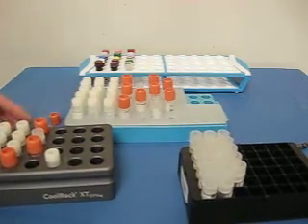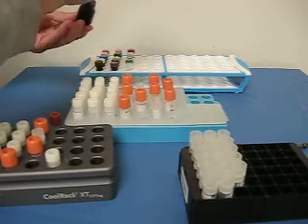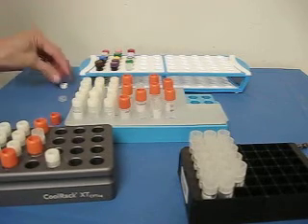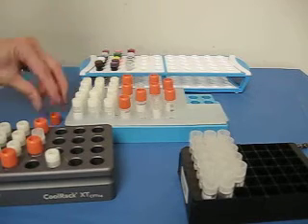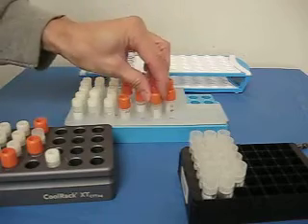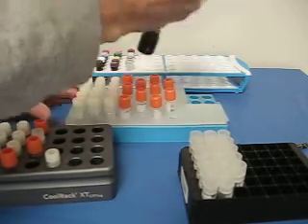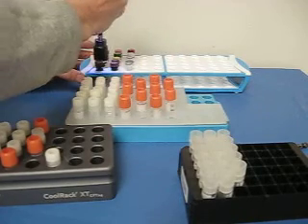And the micro-centrifuge tubes — change another liner.